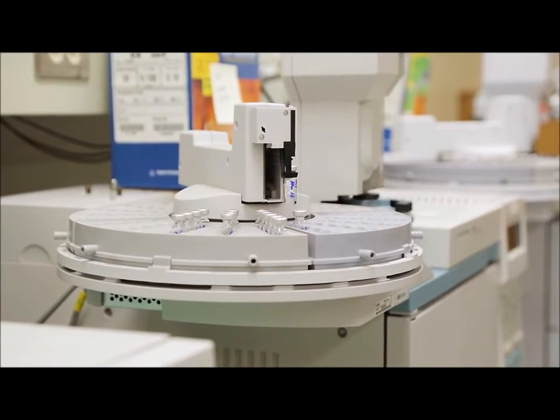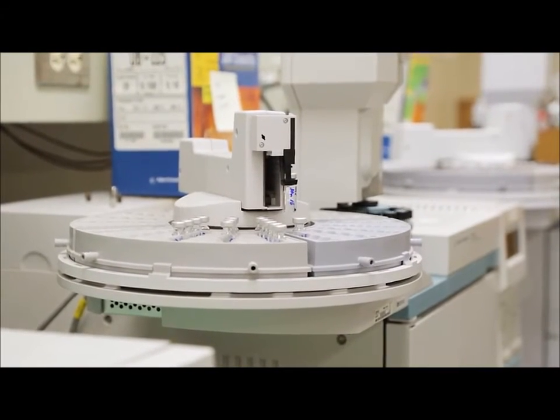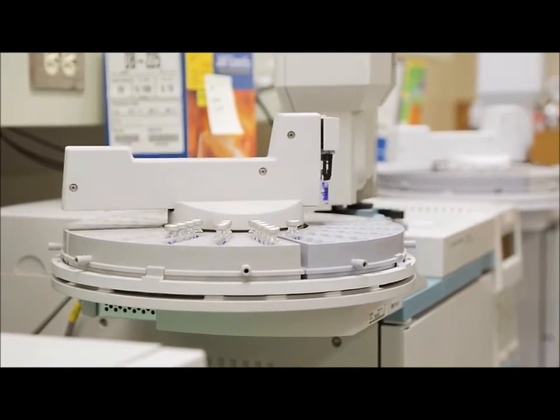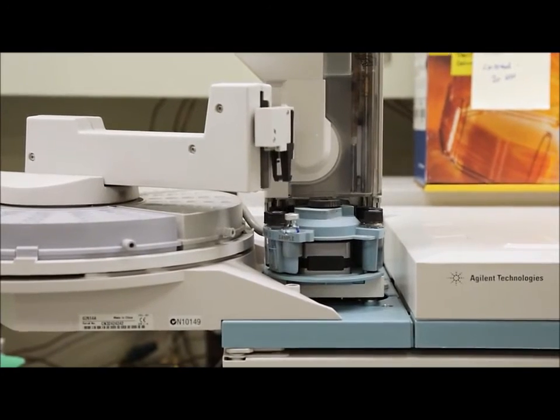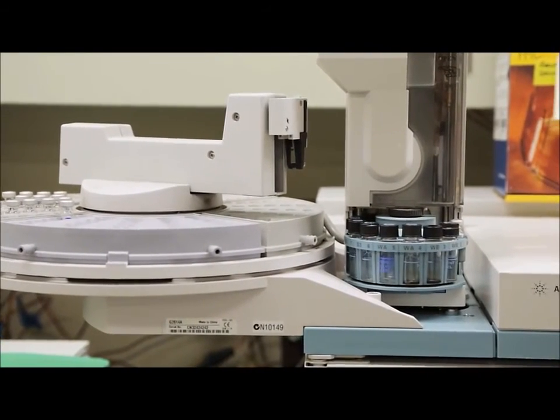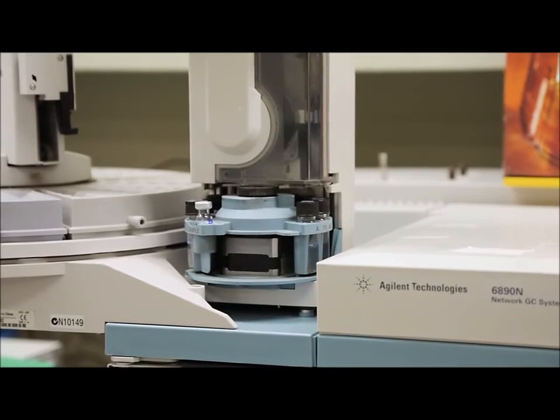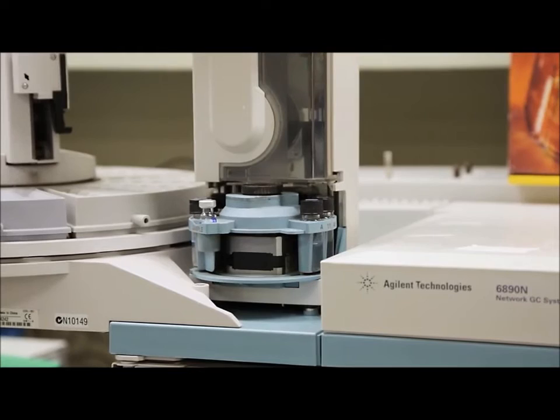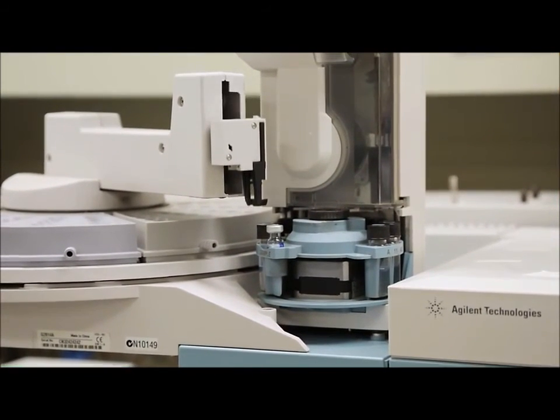The vials are placed onto the autosampler tray of the GC. Everything is set up through the Empower software, so samples are injected through the software. For the parameters of the Empower software, we follow the operating conditions for the GC as listed in the AOCS CE 1I-07 method.